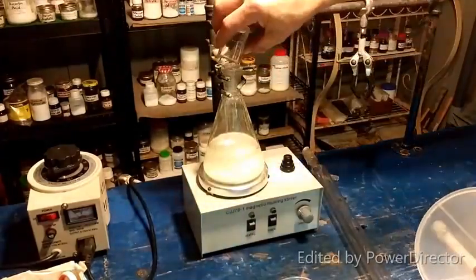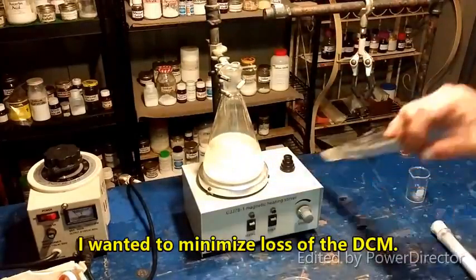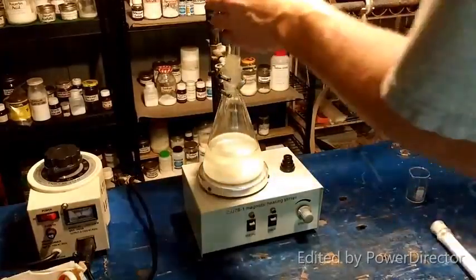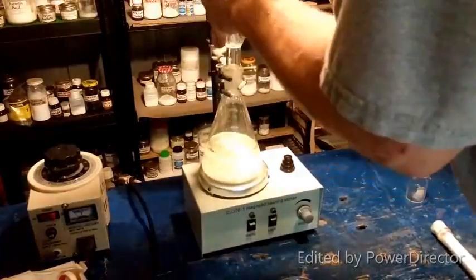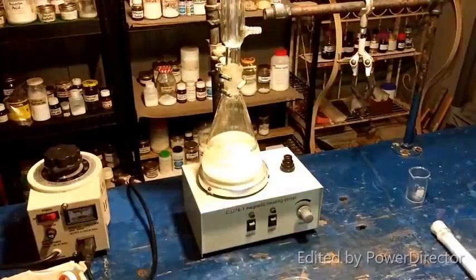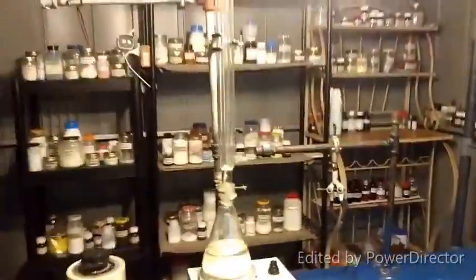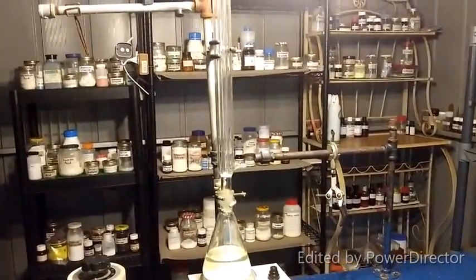Dichloromethane. Okay, cool. Now, all we've got to do is go ahead and set this up for reflux, and we're good.